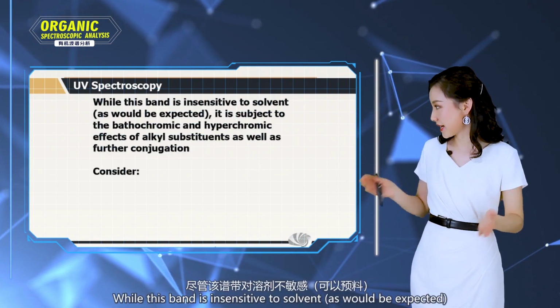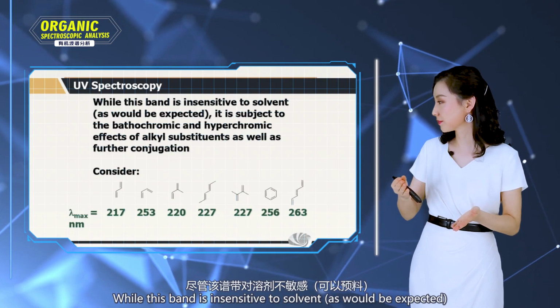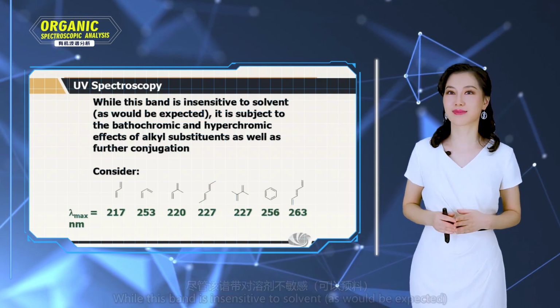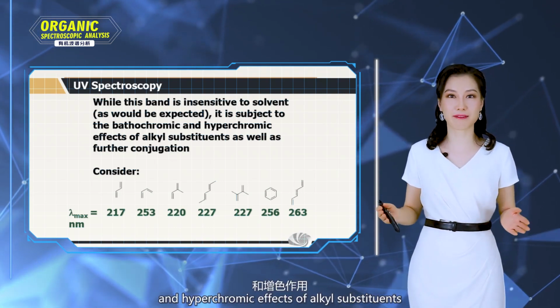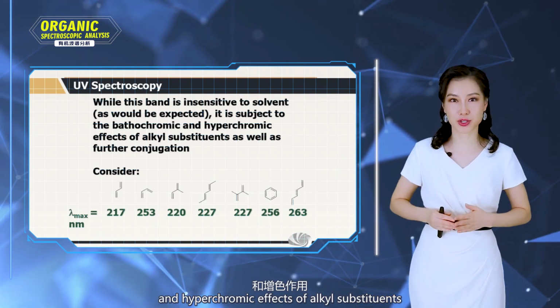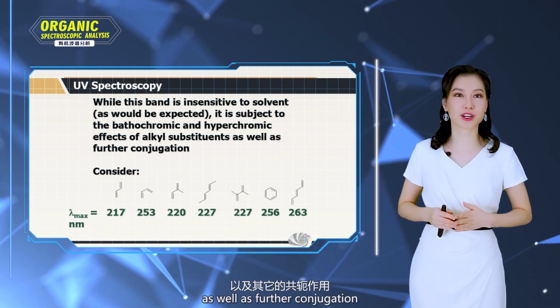While this band is insensitive to solvent, as would be expected, it is subject to the bathochromic and hyperchromic effects of alkyl substituents, as well as further conjugation.